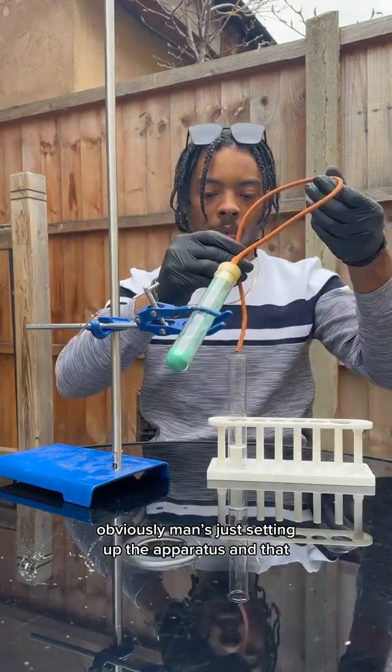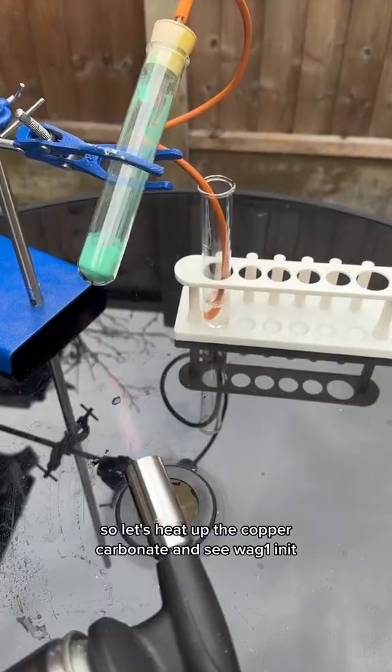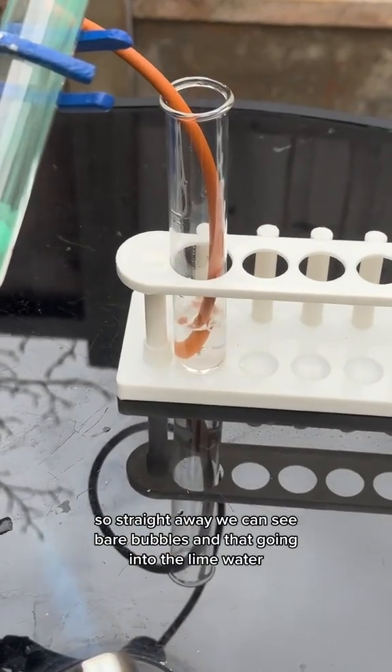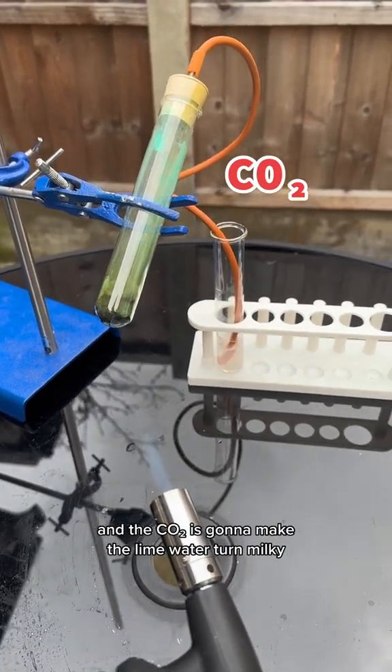Just setting up the apparatus. Let's heat up the copper carbonate and see what happens. Straight away we can see bubbles going into the lime water — that's CO2 gas, and the CO2 is going to make the lime water turn milky.